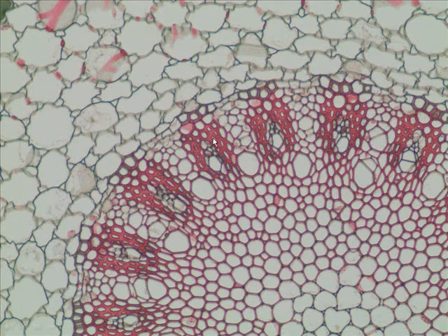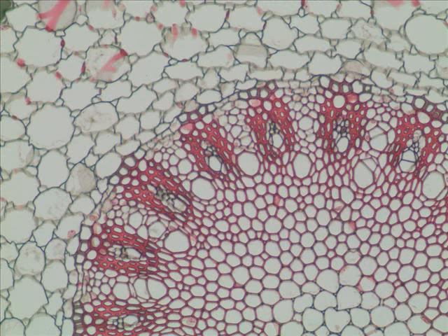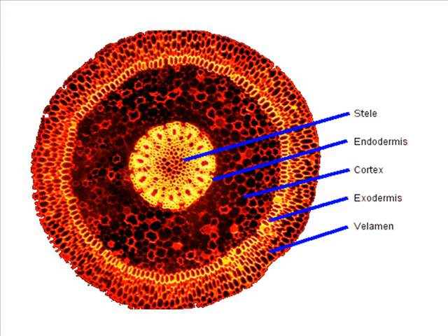Some of you may be wondering about this thick red stain stuff. That is fibers. It is sclerenchyma. I'm not going to ask you about sclerenchyma until we get to stems. Got any more pictures? Yes, we do. Here we are up close and personal with a big old, what cell over here? The xylem, and in between we have this patch of green stained cells. This is what? Phloem.